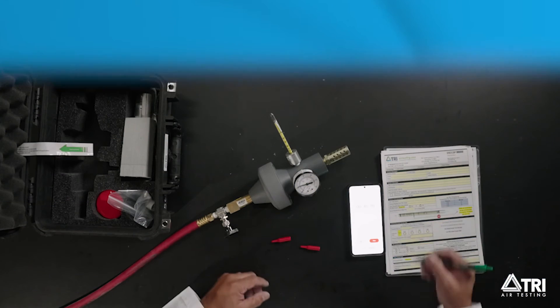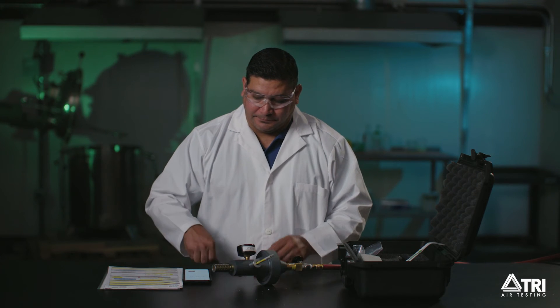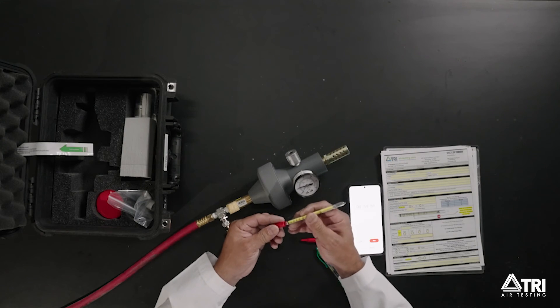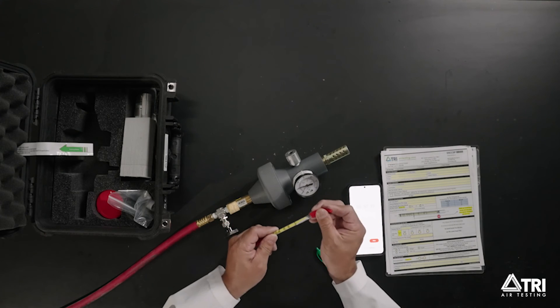Step 6. Once you've finished collecting the moisture sample, be sure to indicate the length of color change on the datasheet drawing of the moisture tube. Put the red caps on both ends of the moisture tube and return the tube to the foam holder.